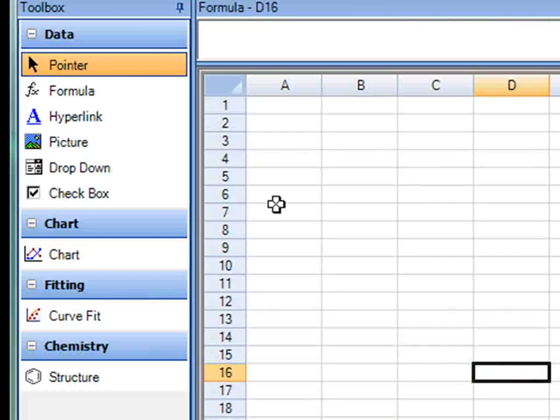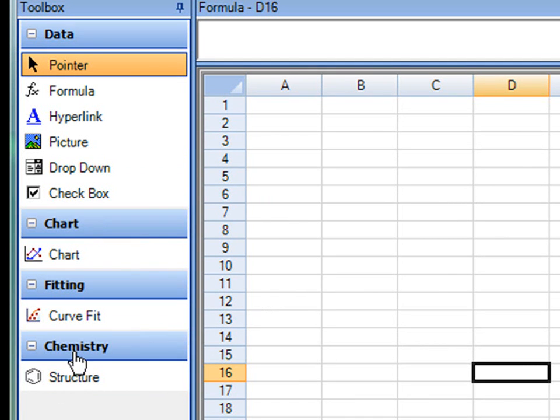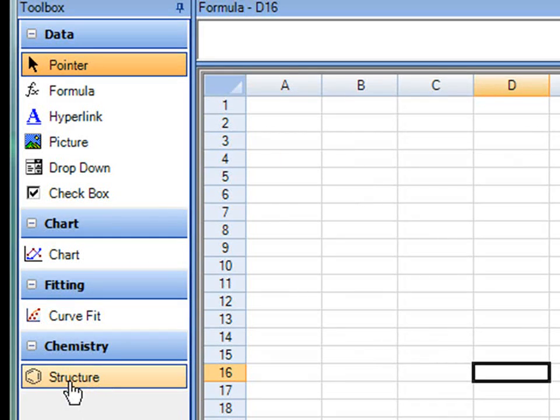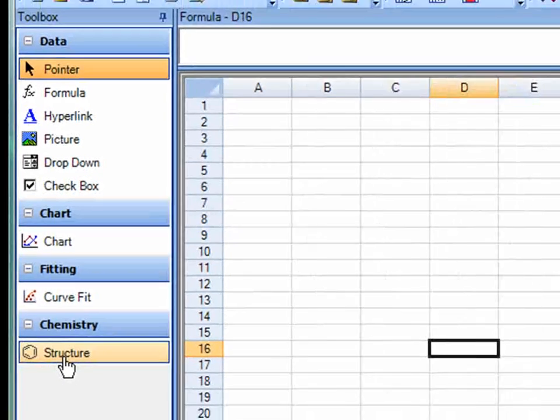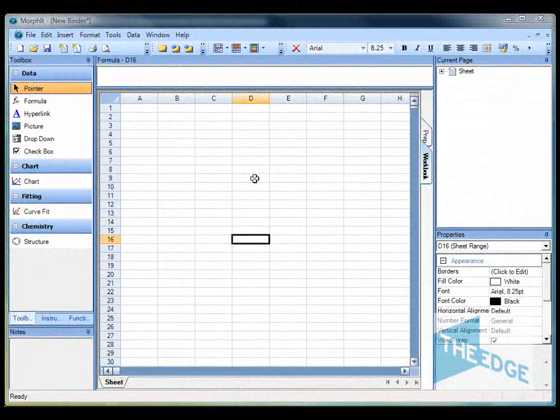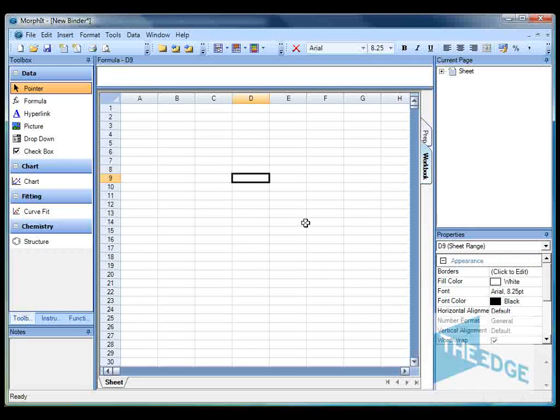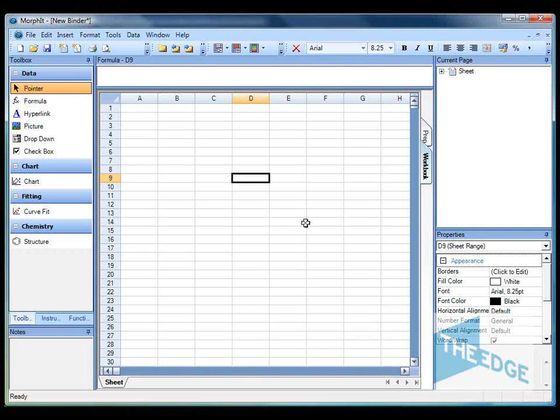If we look at the Morphit interface and within the toolbox you can see there's now a chemistry section. Within the chemistry section there's a new plugin called the structure plugin. The structure plugin allows you to modify the behavior of both cells and columns of a table to be able to view and calculate information from chemical structures.